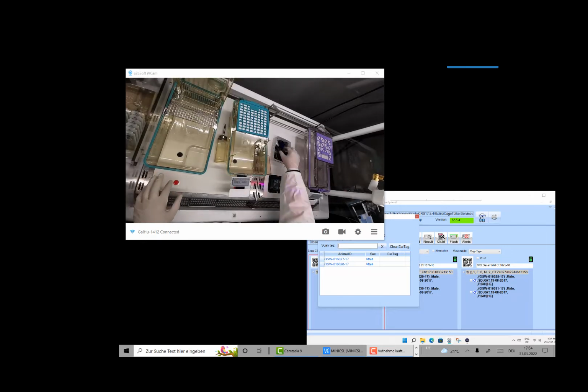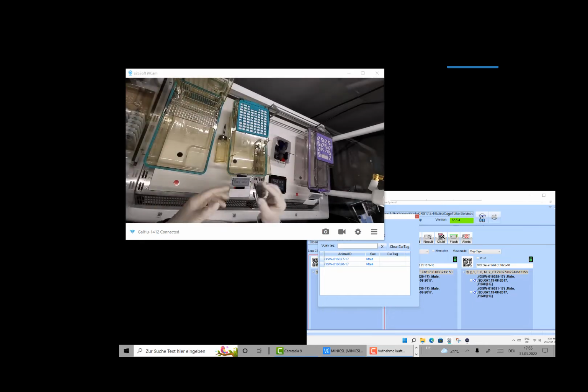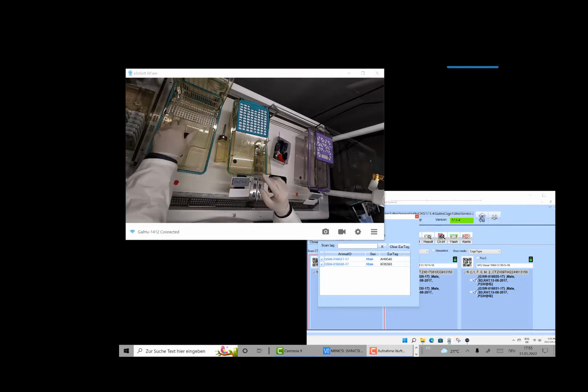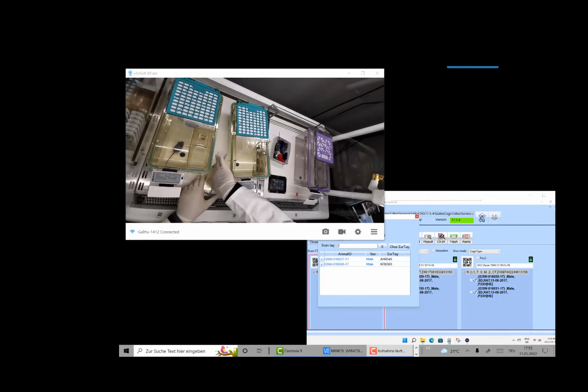I will just pick out of my box with the animals which have been prepared tags, but they also could have a transponder, which you scan into that field and then put the animals. So the procedure is pretty much the same, and I just do that with the scanner here. And when I've done that, I can close that cage and just go to the next one.